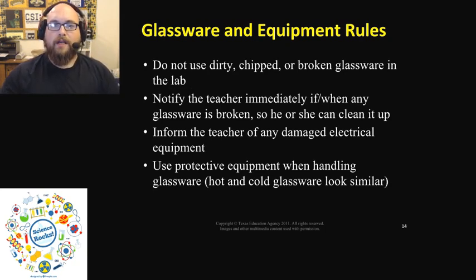Glassware and equipment. Okay, do not use dirty, chipped, or broken glassware at any time. If you notice a crack or a chip in something, please let me know so that we can dispose of it properly and get you a new container.